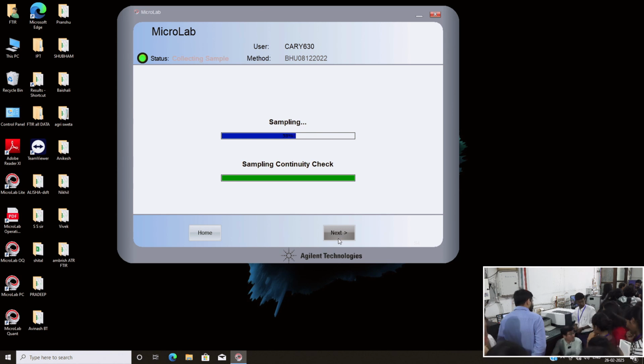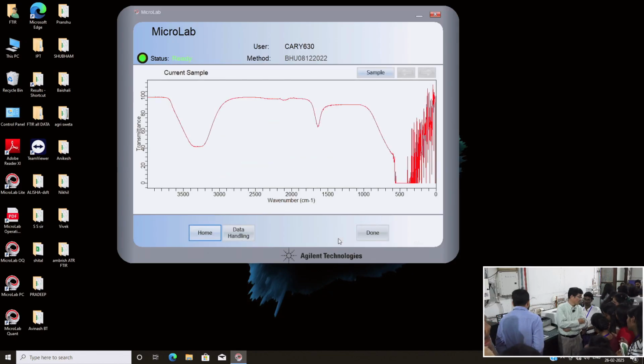Excuse me, sir. If we are putting in a sample, a protein sample, and then what we get in the form of spectra, will that be the solvent spectrum? If it is a protein sample or any sample, then it would be the solution spectrum, because it is mixed in water. So the solvent is water, and the solution is prepared with water. So we measure both. The first time we measured I0, which is without any sample. Second, we measured the sample.